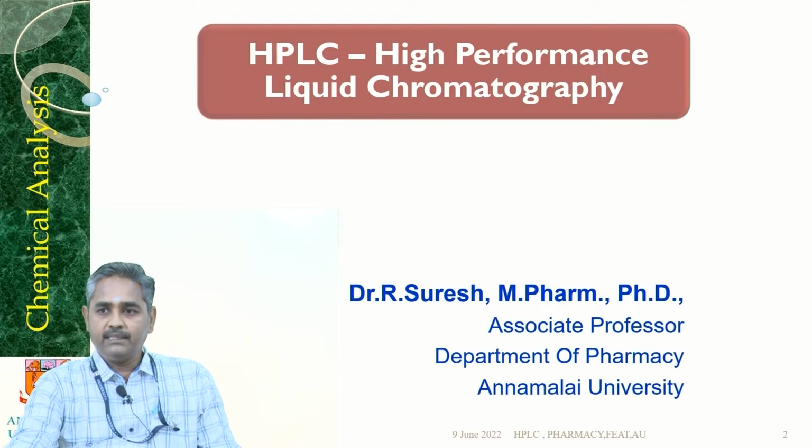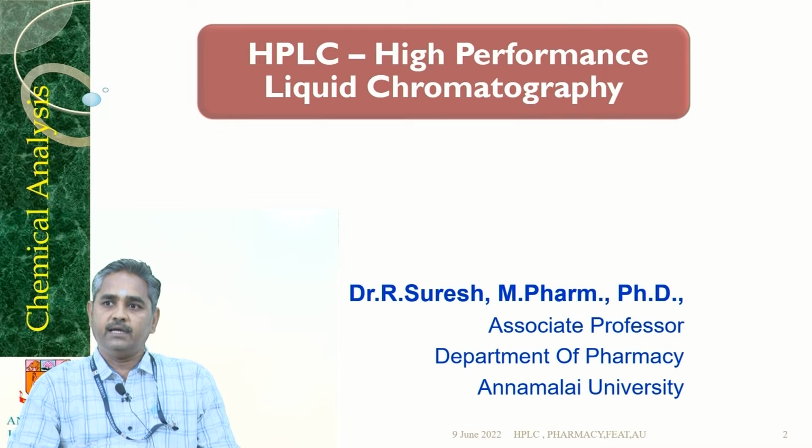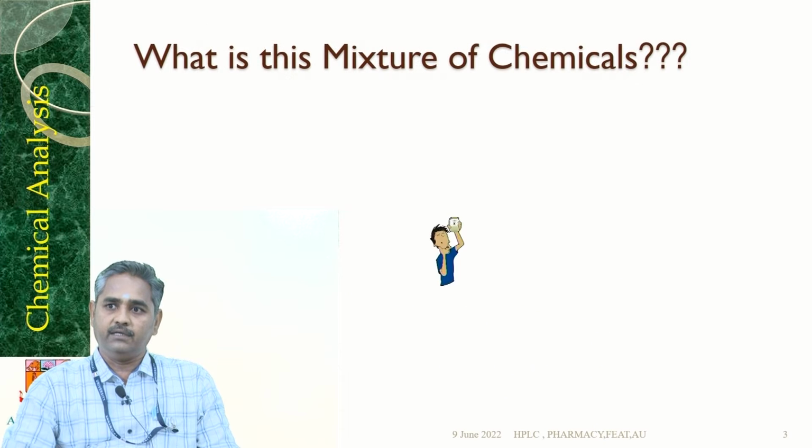Okay. In this session, we are going to see the introduction about HPLC, the basic principles of high performance liquid chromatography, the two different types of separation, normal phase HPLC and reverse phase HPLC, and their application in the various fields of sciences. First, we will see the introduction.